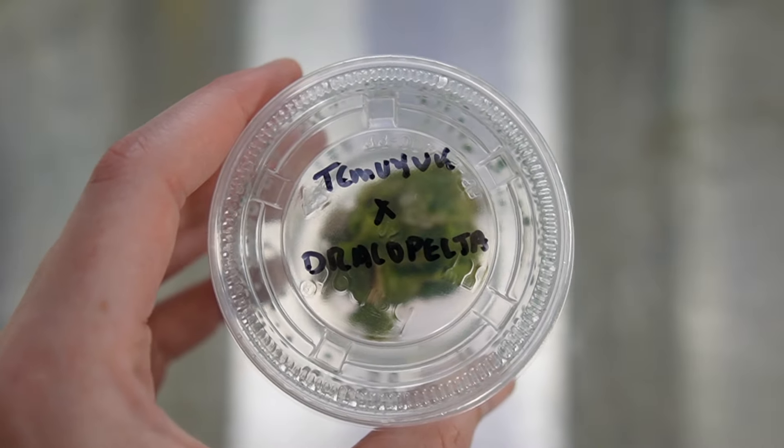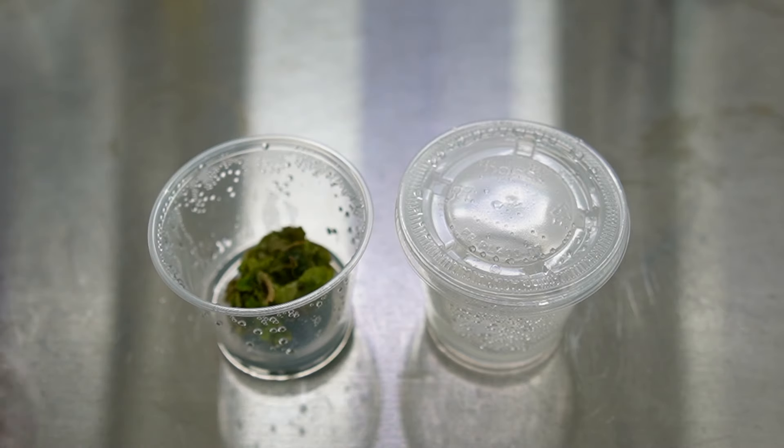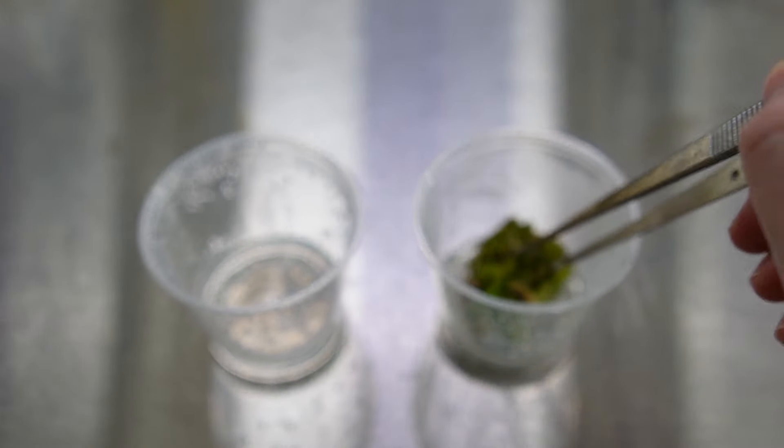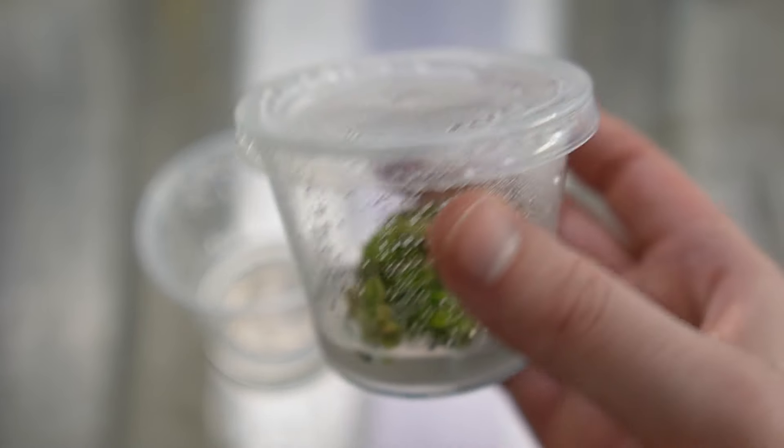By putting the callus pieces into more and more containers, you'll end up with more plants at the end. But even if you don't break up the callus and just take the whole chunk and put it into a new container, you will still end up with a lot of plants. The second and final subculture occurs six to eight weeks after that. I do this final subculture just to grow the plants a little bit larger before they come out of tissue culture, so they'll have the best chance of acclimating successfully.